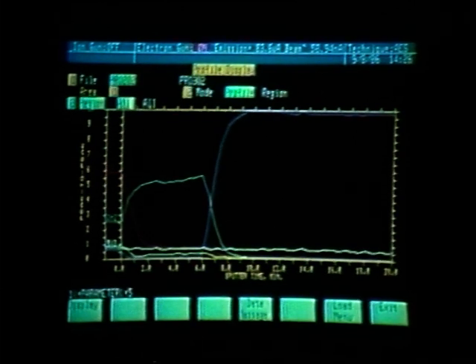Let's briefly review what we've learned about this profile so far. First, we looked at the oxygen peak and determined that the analysis window was incorrectly set. So by utilizing the profile redefine routine, we were able to more accurately define the oxygen peak from the start of the profile all the way through the chromium peak, and we eliminated most of the influence by the chromium.